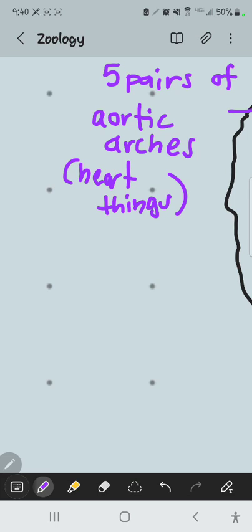There is, you'll find, that's kind of hard to see. Use paintbrush. No. Limited my color. Orange. Try orange. Okay. There are 2 pairs of what are called calciferous glands.